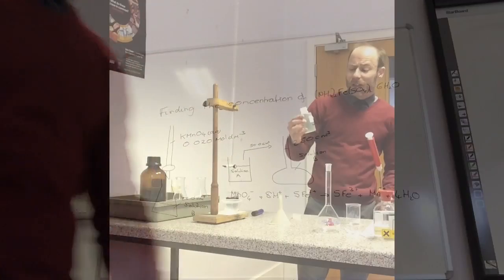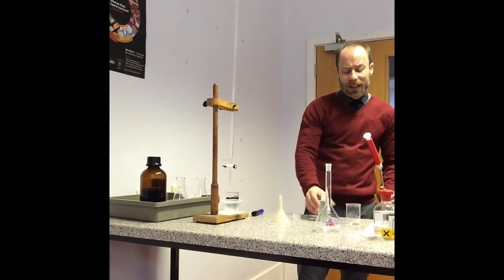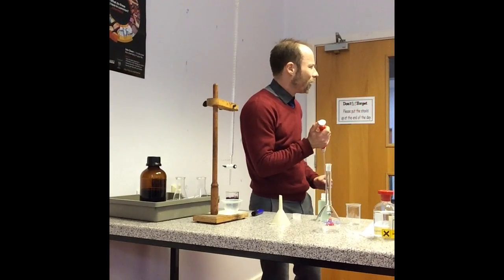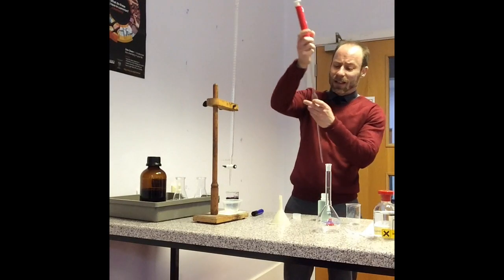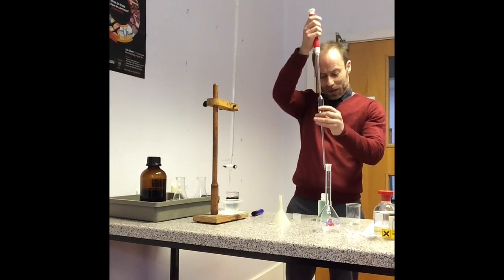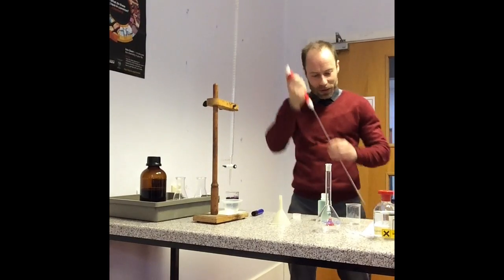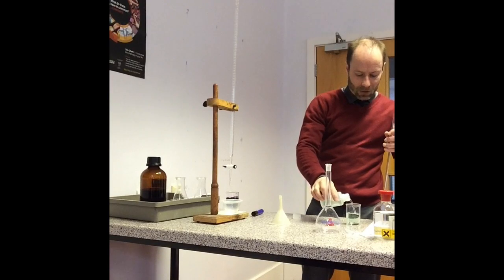So the first thing, I'm going to take solution A, and I'm going to dilute it down by popping it into my volumetric flask. We need 50 centimetres cubed of this. This is a pipette. This has 25, so I need to do it twice. You'll need to do it twice as well. I may do it in that, so I don't knock it over.